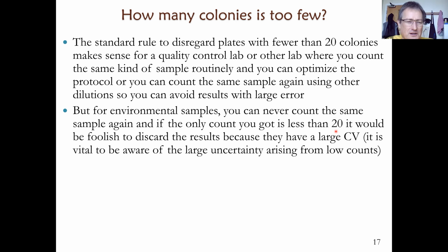Just one important thing to remember is that you can always test the procedures. In this case, you can test it by spiking your sample with a known number of viable bacteria that you can somehow distinguish. Maybe they carry GFP or whatever, and you can pick that up. And that's effectively using an internal standard that can test your procedure.